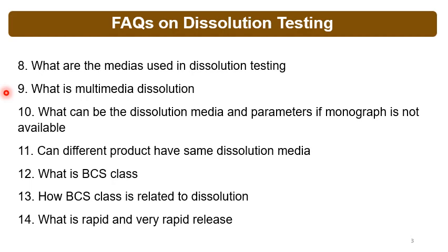Can different products have the same dissolution media? So yes, different products may have the same dissolution media, but dissolution testing is product specific, and 0.1 normal HCl can be used for many of the products, but the parameters and the specifications will vary.